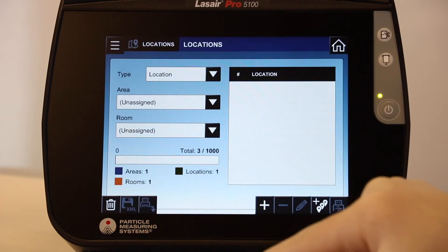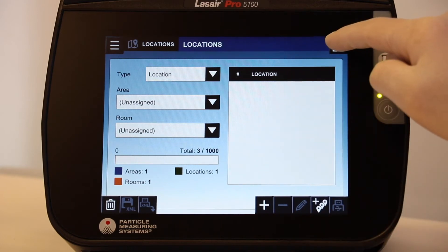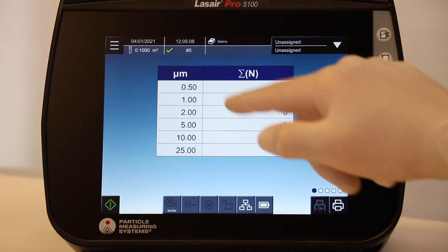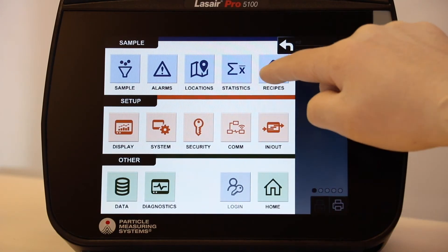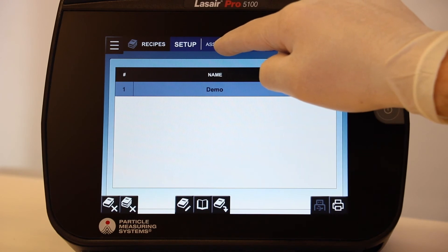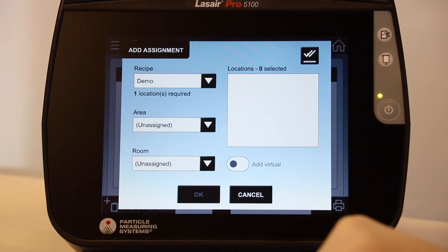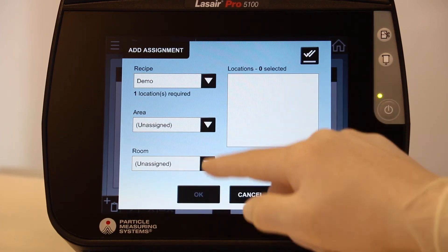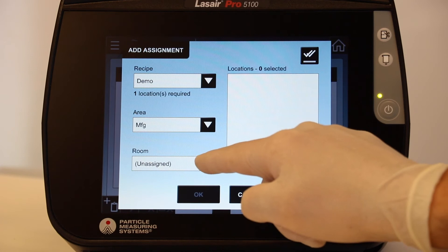Now that we have an area, room, and location set up, we'll return to the home screen. Then navigate to the main menu and select the recipe icon. Navigate to the recipe assignment. We'll use the demo recipe and first choose an area — MFG in this case. Now we'll select another room, lab.